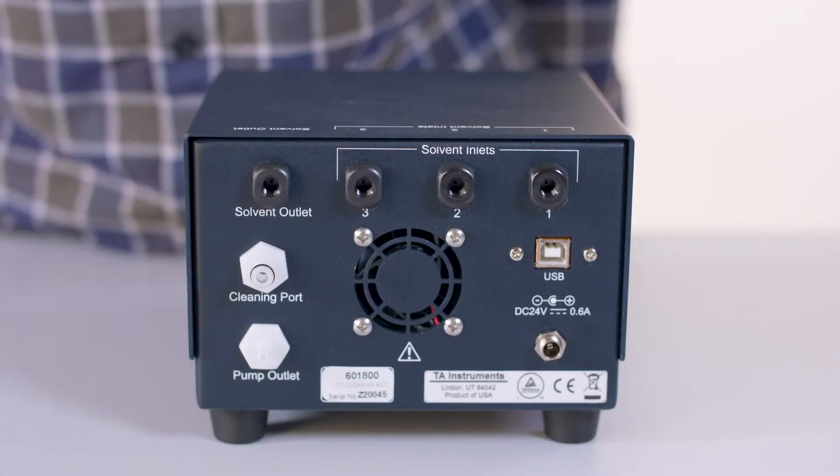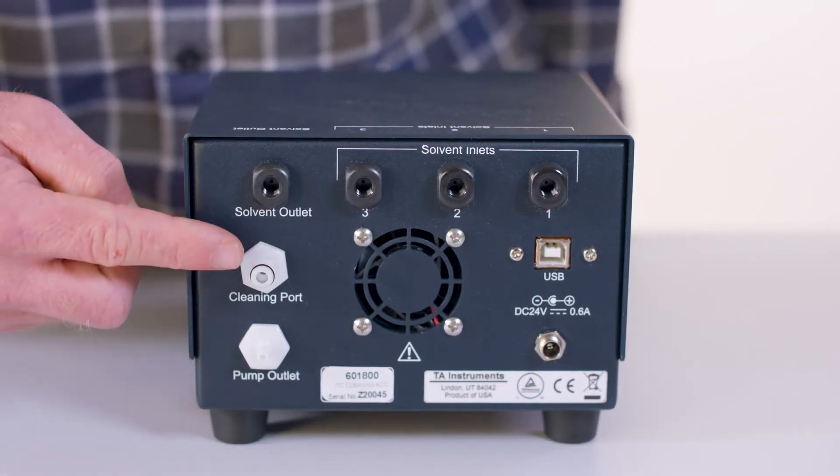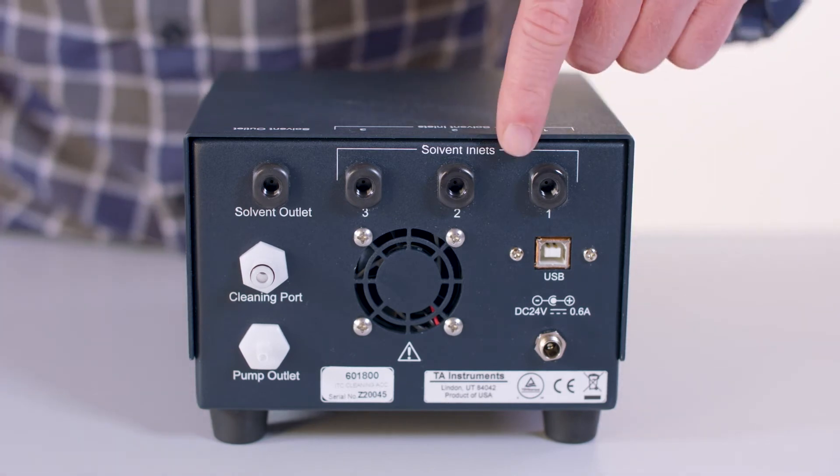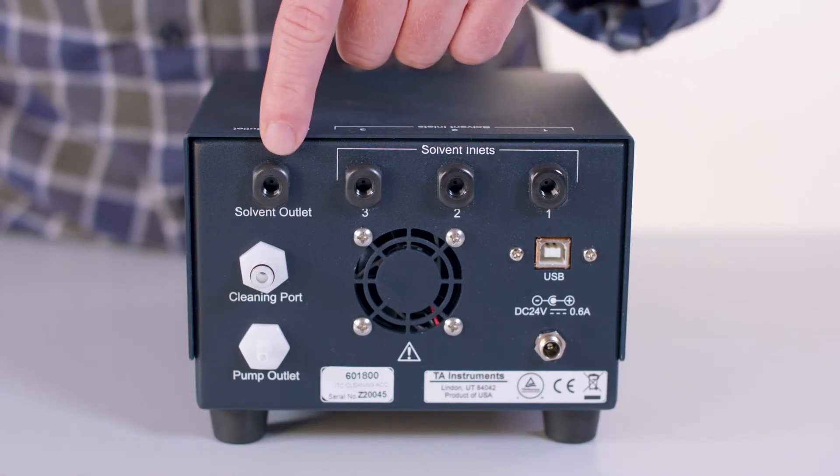In the back of the cleaning station, we will see a pump outlet, a cleaning port, three solvent inlets, and a solvent outlet that will pump water through the instrument.